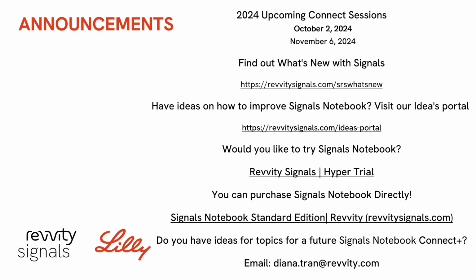Great. Now, have you observed any resistance of the lab personnel to incorporate it into their normal routine? I don't think we have. We tried to keep signals when we rolled it out to be as close to the previous solution as we had, so it was a seamless transition. And for the most part, people have wanted these integrations, and so they are using them quite a bit. The ones I showed are mainly for chemistry, for our external action type integrations.